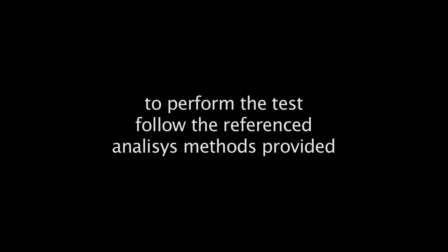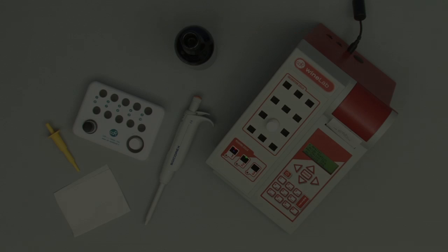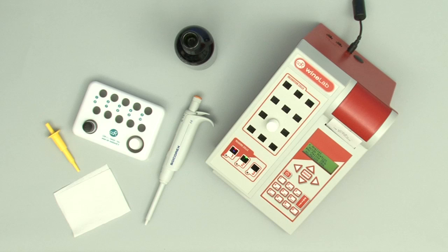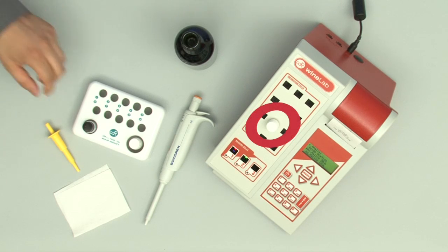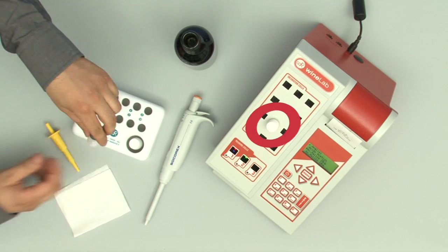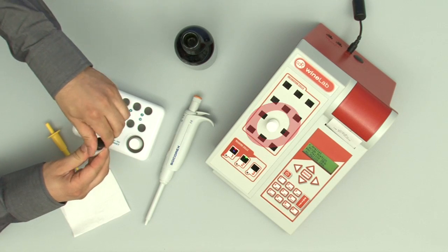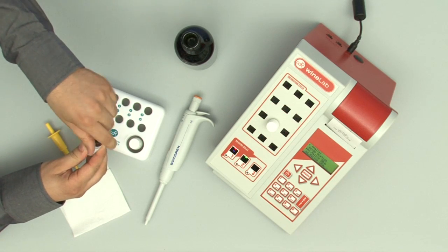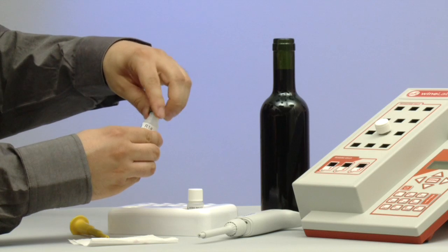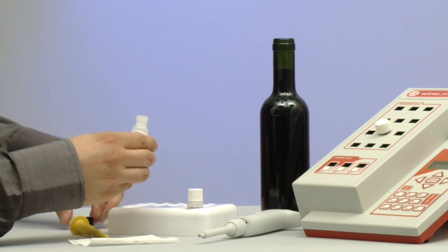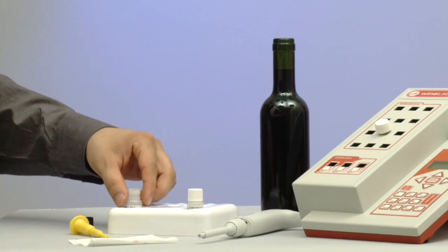To perform the test, follow the reference analysis methods provided. After placing the test tube containing buffer R1 in one of the incubation cells, prepare the flask with reagent R1A for collection.